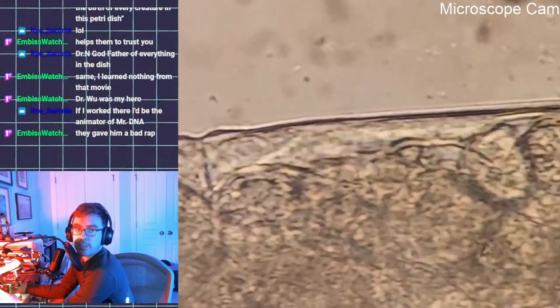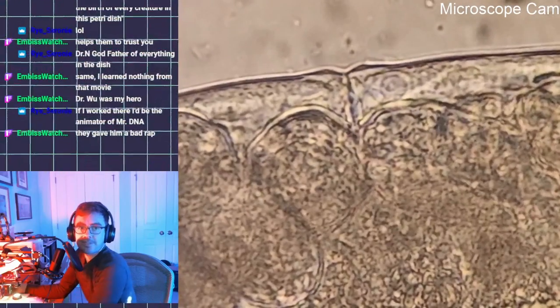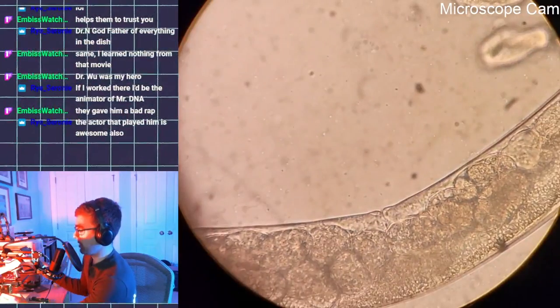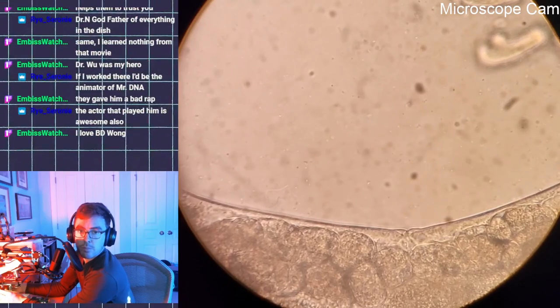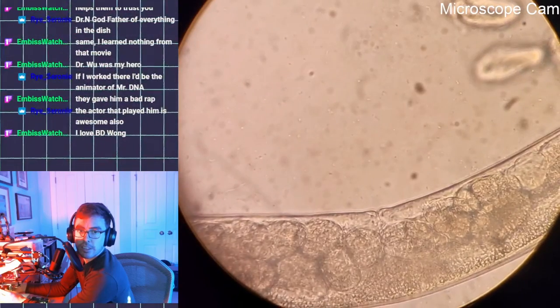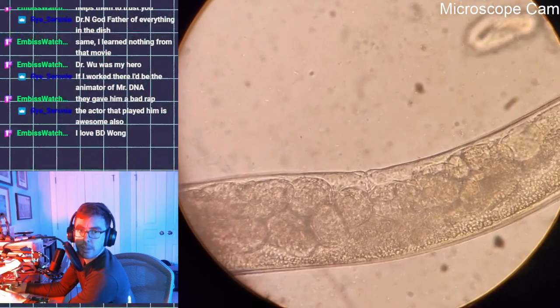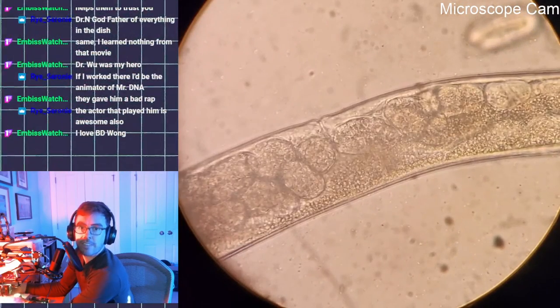Oh, wow. I feel like this one is also ready to pop and give birth. Actually, there's some movement. Maybe if we watch long enough, we'll see it. Why is she moving? Let's just examine this worm's birthing process. Maybe. Because we can also keep an eye on this egg over here in case it starts hatching.